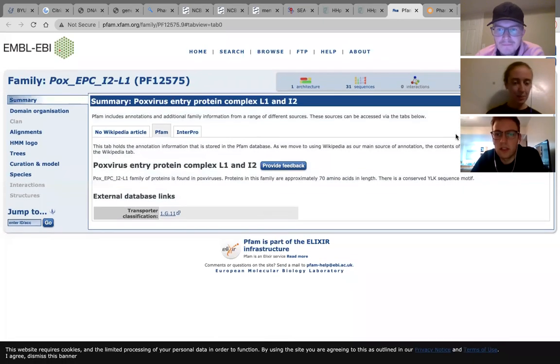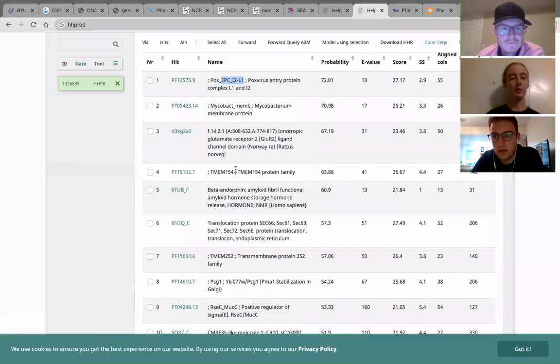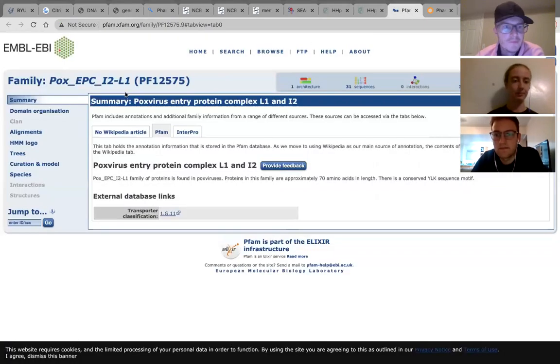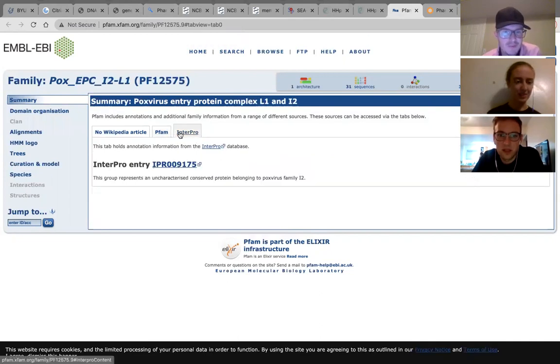So real quick, Tiana, I think you put PFAM for the database instead of HHPred for this one specifically. Oh, yeah, because this one's in PFAM. Yeah. So I'm not sure. I don't know where the gene is in this one. Anybody else know? I've never seen this. I haven't seen this either.